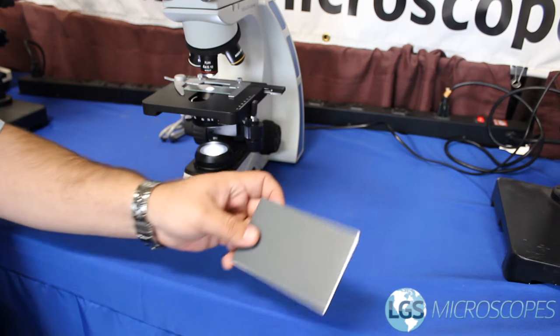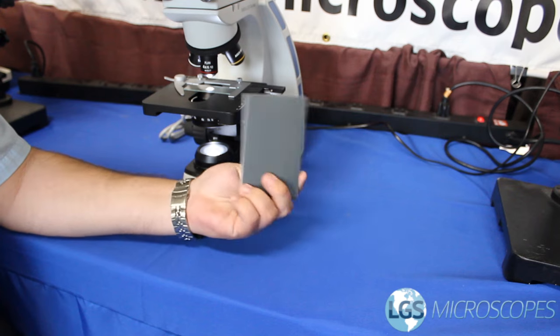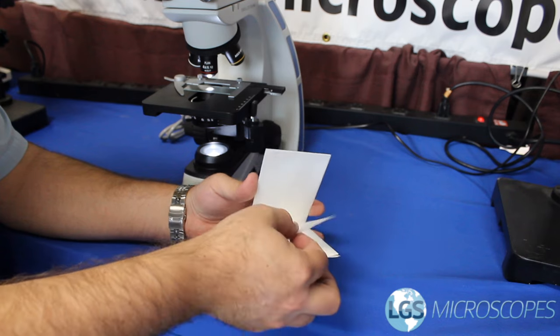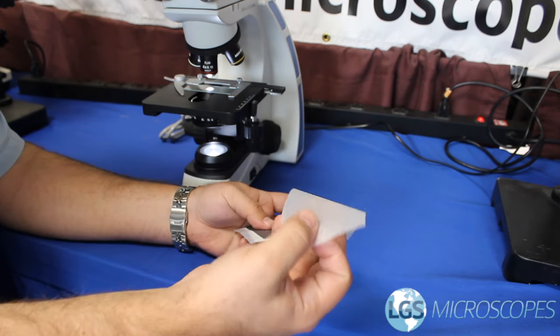To remove the oil you can just use some lens paper. Sometimes it'll come in a little book like this and there's a bunch of sheets in here, sometimes you tear it out, these ones are just kind of laying in here.